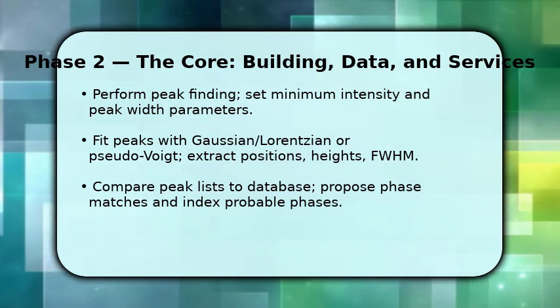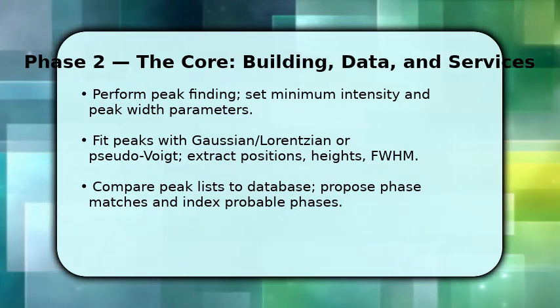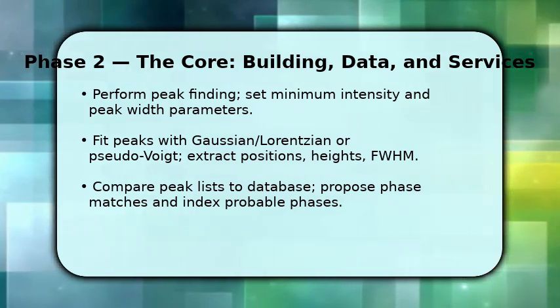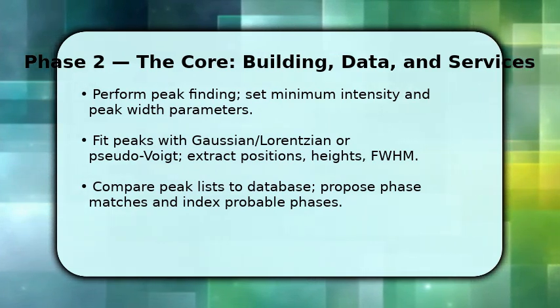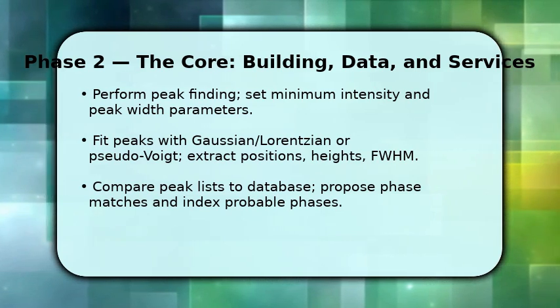Once you have a reliable peak list, match reflections against the database to propose phases. Prioritize consistent sets of peaks and explain why a match fits, rather than accepting the top hit blindly.